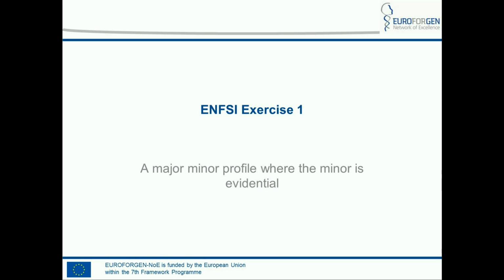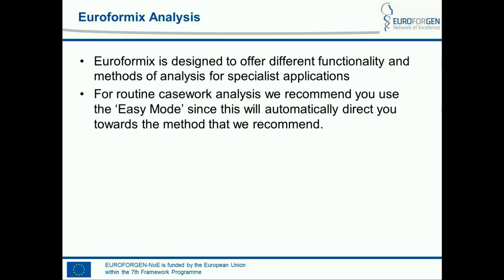I'm going to talk about the use of EuroForMix to analyse a sample that was used in an ENFSI exercise. It's a major-minor profile where the minor profile is evidential, and these are typically the most difficult cases to analyse. First of all, EuroForMix is designed to offer different functionality and methods of analysis for specialist applications, and we found that this could be confusing to users who are new to the method.